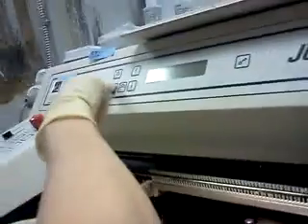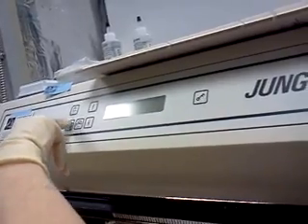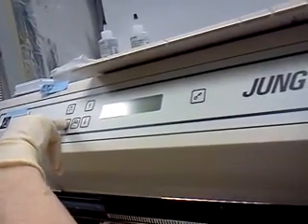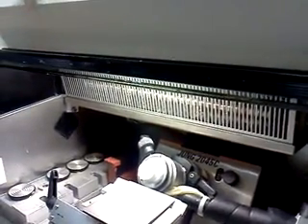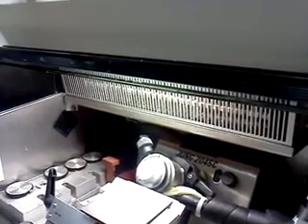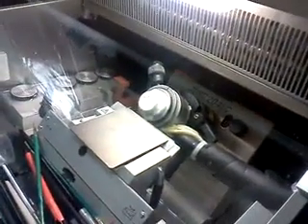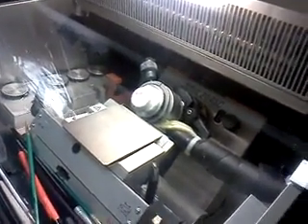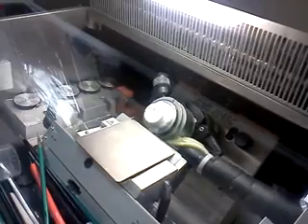So let's change this, let's bring this up to 20. At the beginning, 29. Yeah, but we're doing a different tissue, and we haven't done that in a while. I could go look it up. I said I'm going to play around, because I want you to see on your own what the problem was. So let's go way up. So it turned it off. We're going to go to 20. So now we got to let it warm up for a minute. And so we're going to let this warm to 20, let this warm to 20.